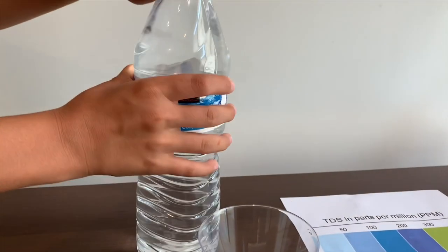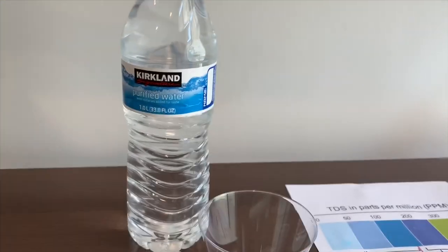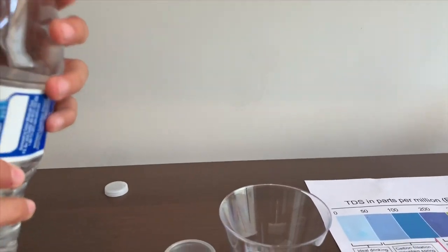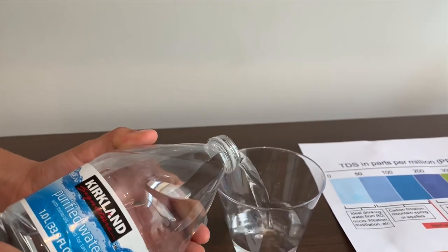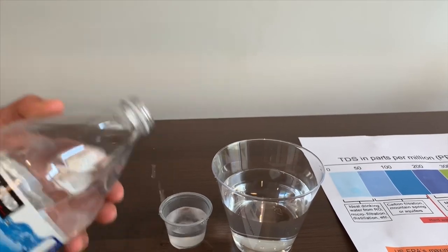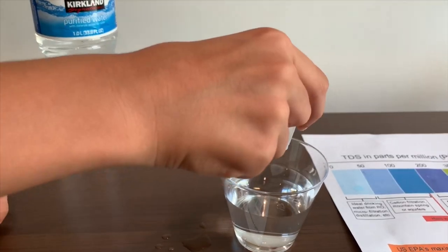Let's pour some in and see the level of the TDS and the pH. This is a little too much, let's pour some back.